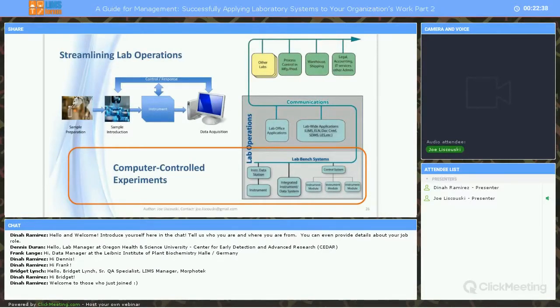As part of the investment ROI evaluation, you also have to determine how long the experimental process will be in use and whether the cost for engineering, evaluation, and equipment is worth the effort. A fully automated process could be run for long periods of time, but would require someone to monitor the system and its performance, essentially a quality control effort on the process. A fully automated system would provide better predictability for materials usage and offer more consistent and reproducible data.